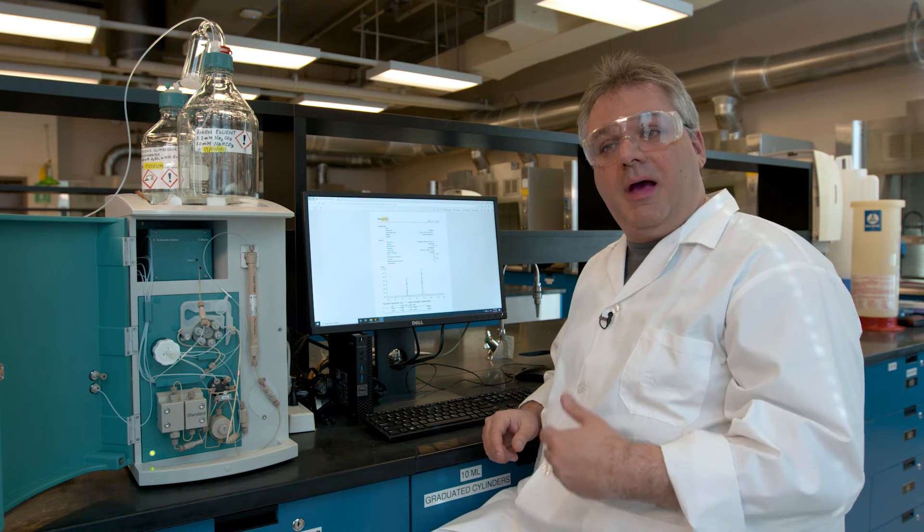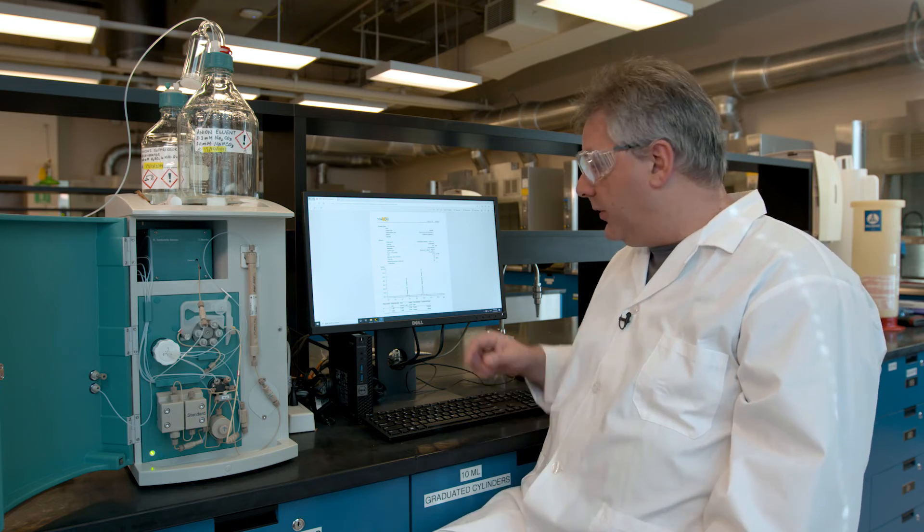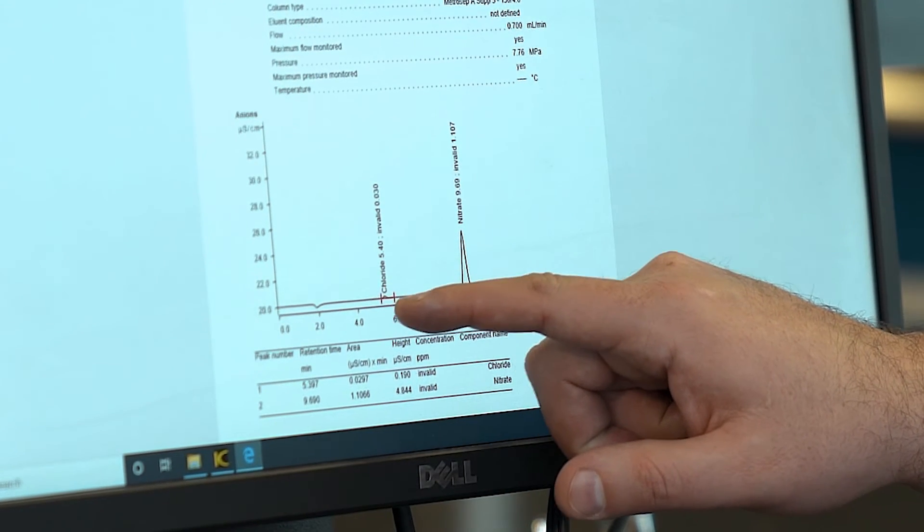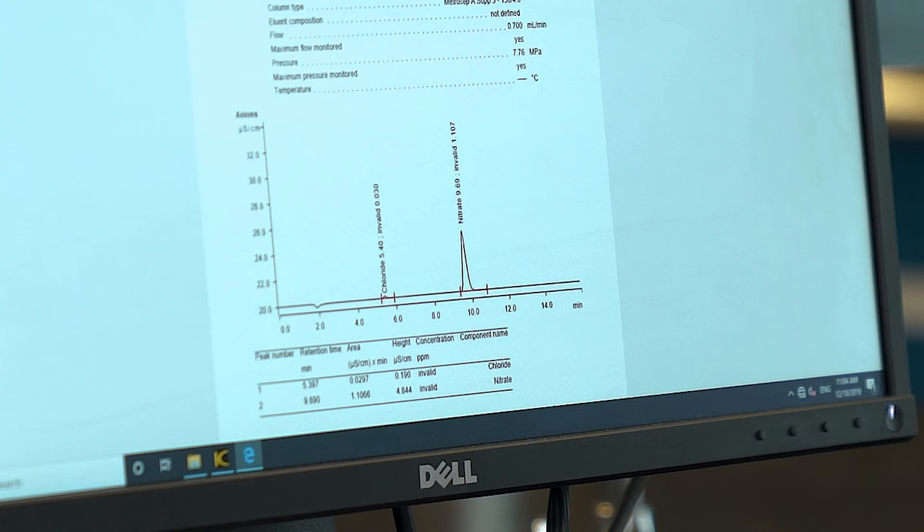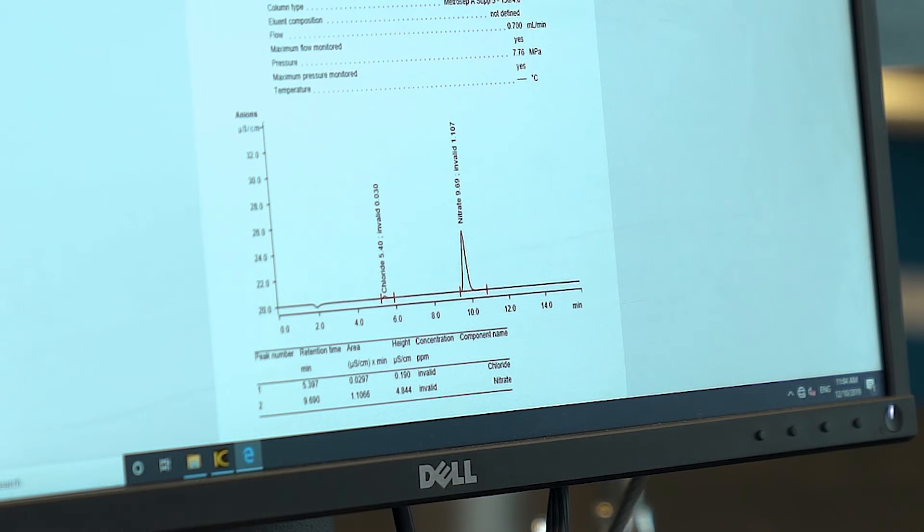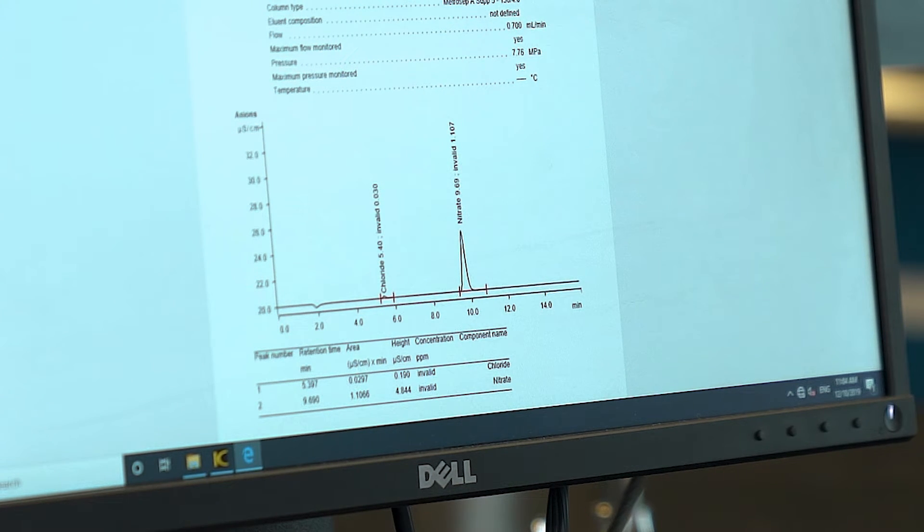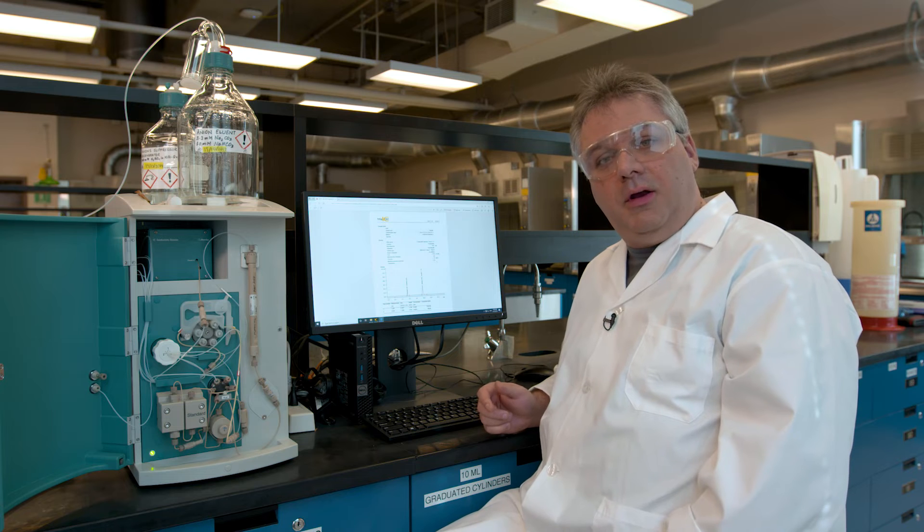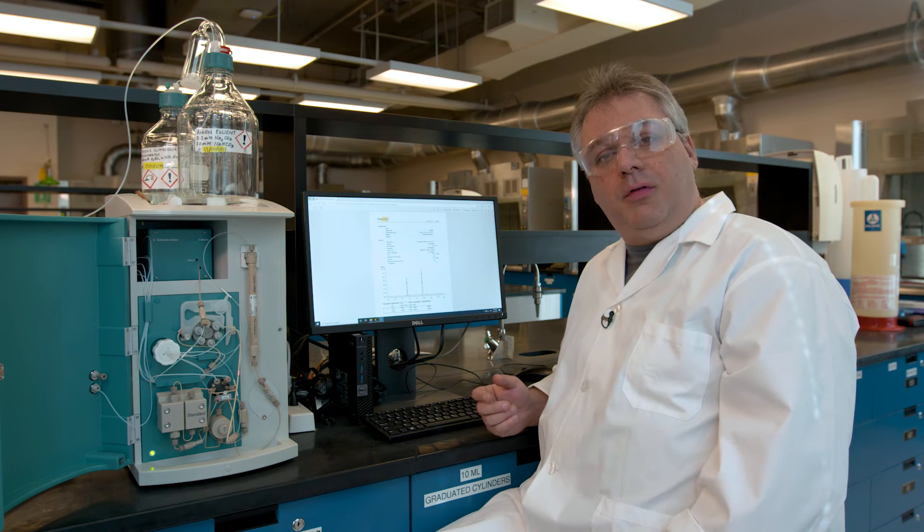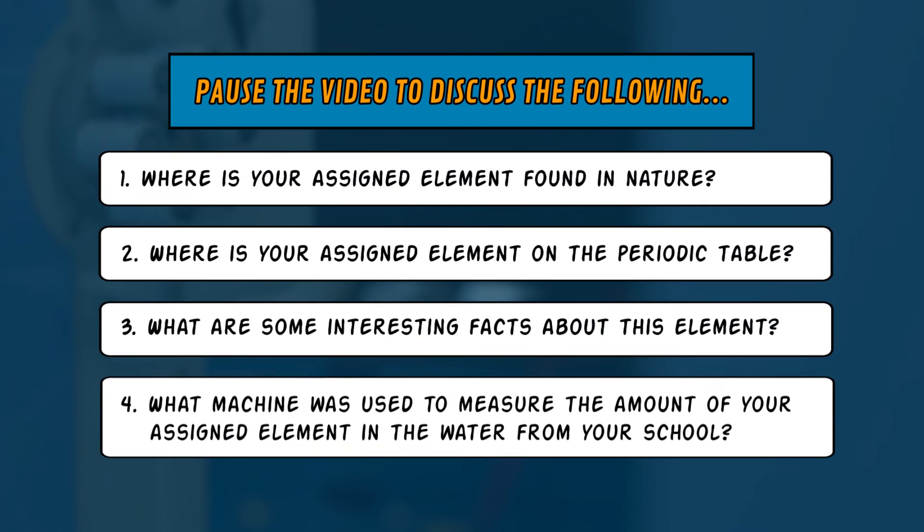So along here we have a chloride peak and a nitrate peak. You can see that the nitrate peak is much larger. That indicates that there's more nitrate in the sample than there is chloride. In the next segment, we'll look at what this means for the results we got for your school. Pause the video to discuss the following.